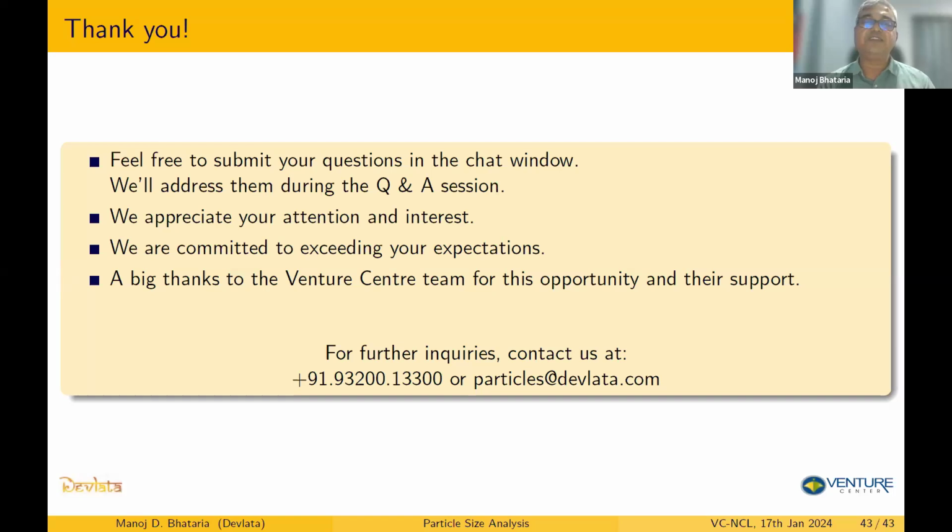Now let's compare a 100 nanometer particle and a 10 micron particle. The 10 micron particle scatters so much more light that your 100 nanometer particle will not get registered at all.